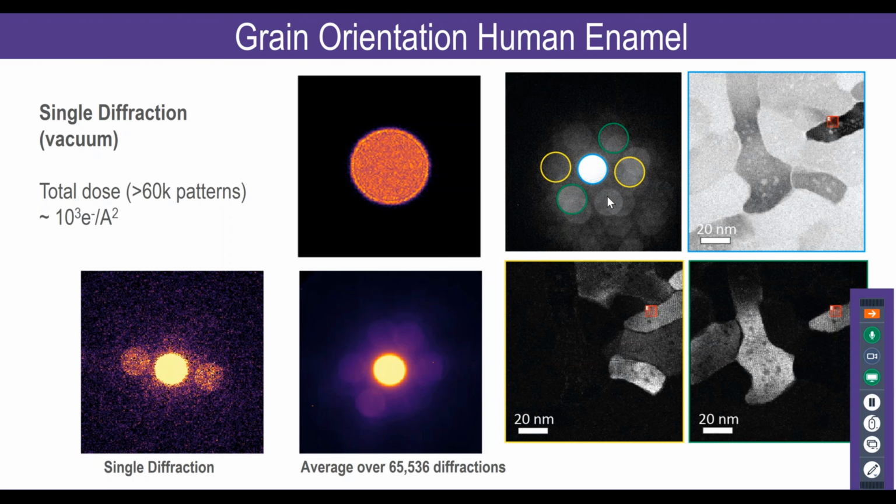And then another example here on the bottom right is the one that is opposite. You can see here you have 2 very distinct, sort of big grains highlighted in green, and then the one on the far right actually reflects. Its reflection is part of both yellow and green here. And you also get for free a little bit of lattice here as well, which can be used in the future for applying other processing methods, which I'm going to talk a little bit more about in a few minutes. And then you can look at different orientations as well.